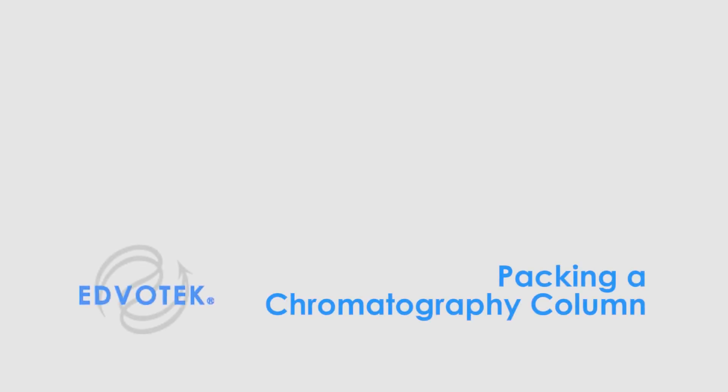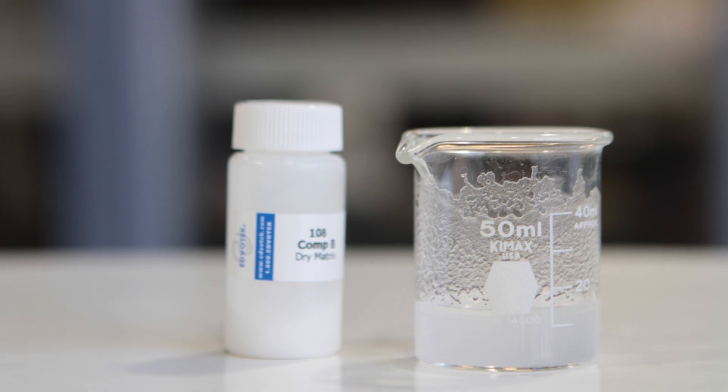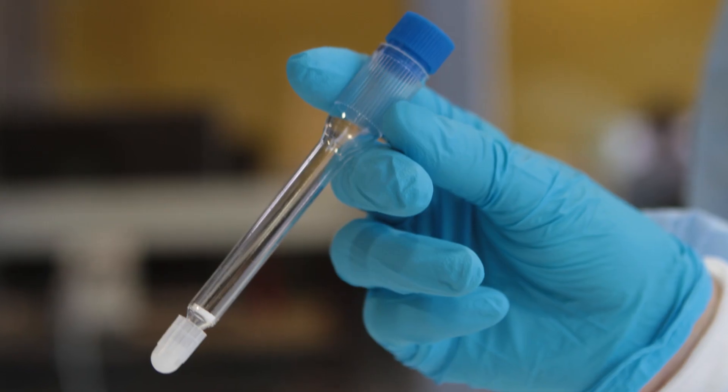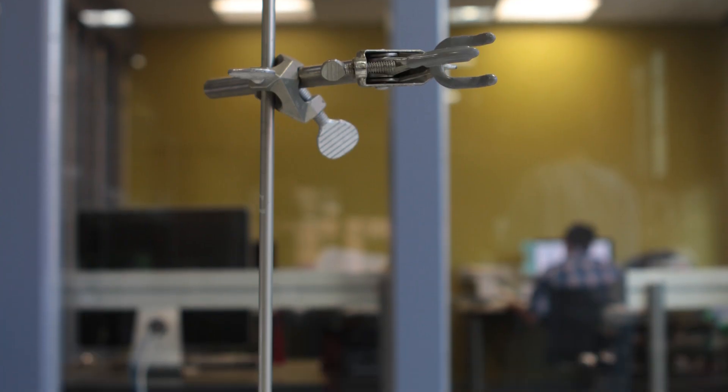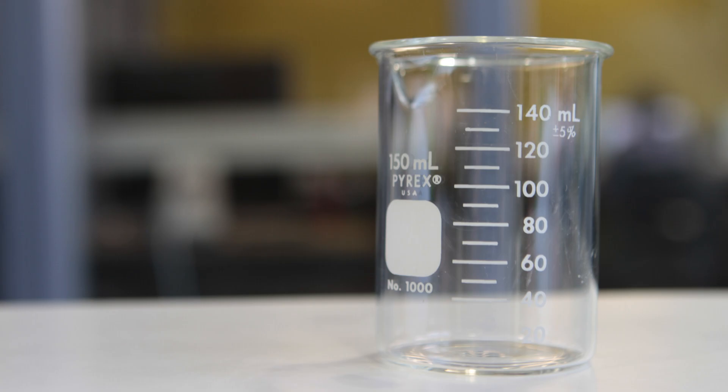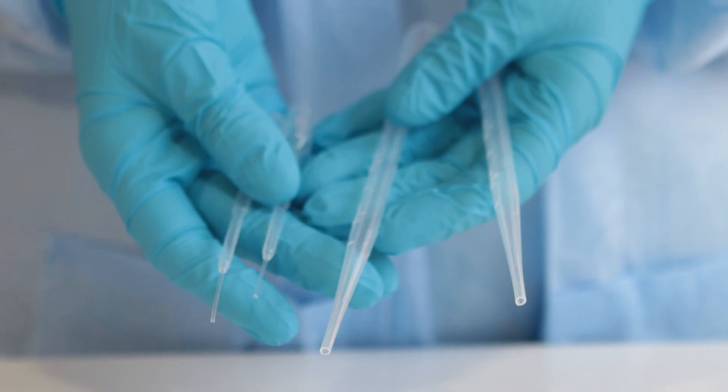Edvotek instructional videos: packing a chromatography column. You will need rehydrated chromatography matrix, empty column, ring stand and clamp, an empty beaker, and pipettes.